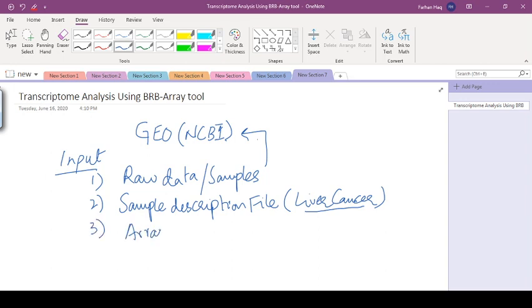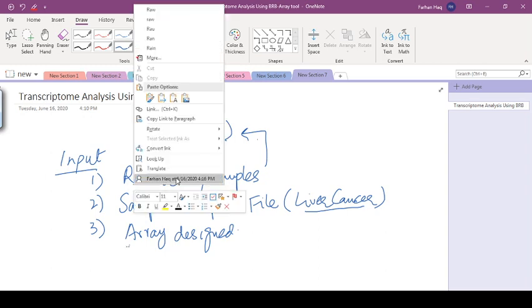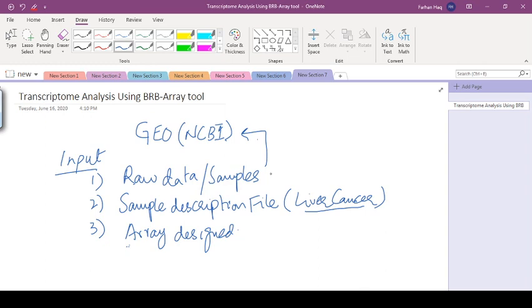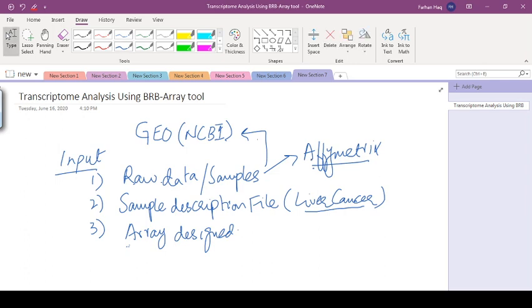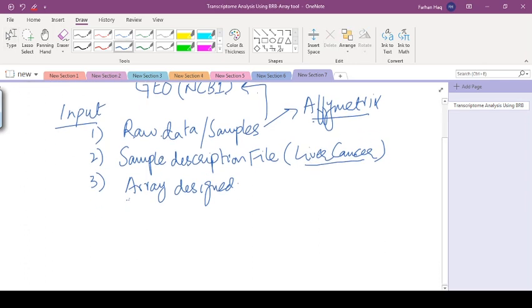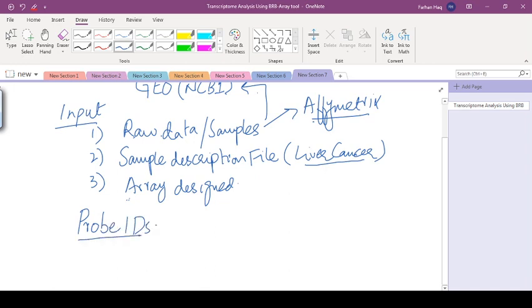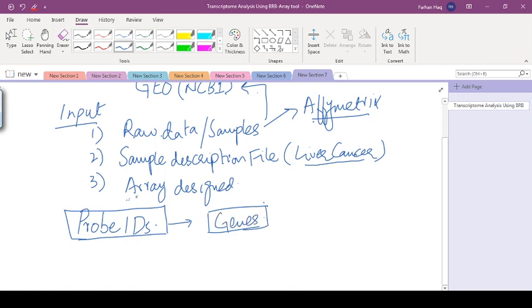The third main thing which is required as an input is the array design. This array design is actually the description of this raw data. For example, if we are using Affymetrix platform, the design of that array. The arrays are actually designed; these platforms Affymetrix and all the different other microarray chips like Illumina, BeChip, or Agilent, are organized in a raw form as the probe IDs, probe identifiers. Actually, these probe IDs are associated with different genes. This array design contains the information of these probe IDs and gene information.